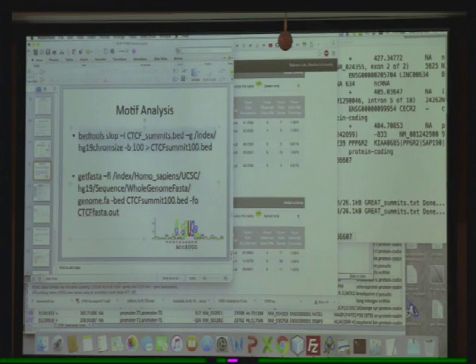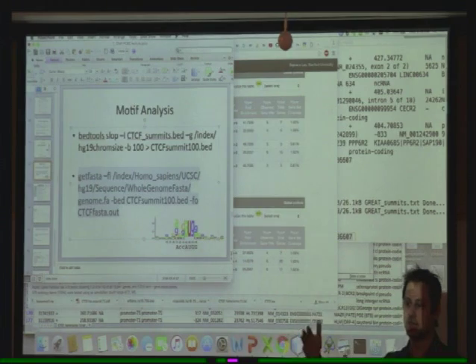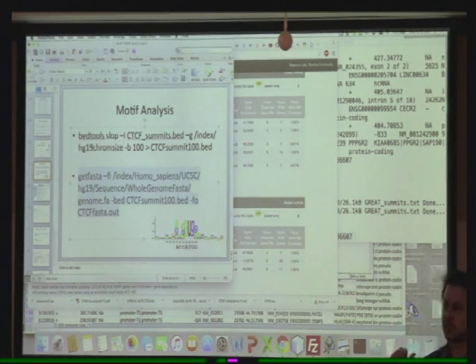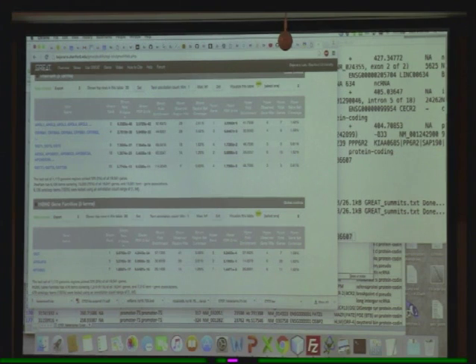That's what this does. And then getfasta, that's really important. So getfasta takes those chromosome start and stops of those 100 base pairs, and it looks at an annotation of those regions and pulls down the sequence. So it'll say from these coordinates, and let me quickly download that file because I think it's interesting to look at.